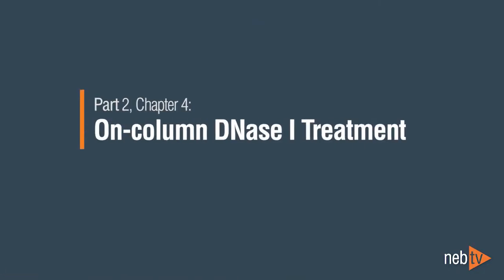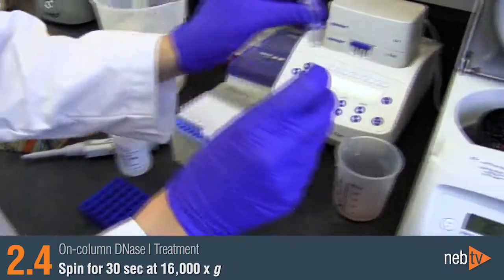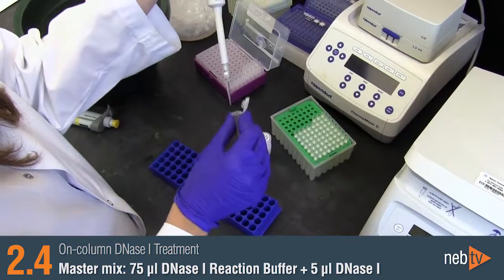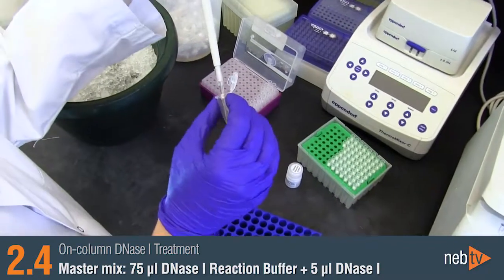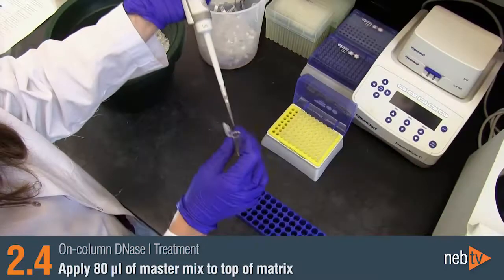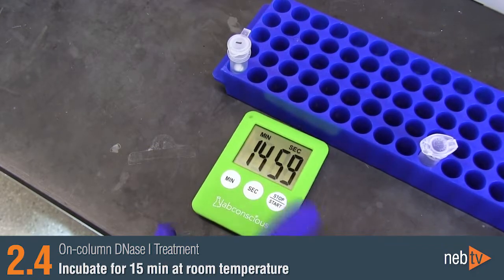On-Column DNase-1 treatment — this step is optional but recommended. Add 500 microliters of RNA wash buffer to the column and spin for 30 seconds. In an RNase-free microfuge tube, prepare a master mix of 75 microliters of DNase-1 reaction buffer and 5 microliters of the reconstituted DNase-1 enzyme for each prep. Apply 80 microliters of this mixture to the top of the matrix and incubate for 15 minutes at room temperature.